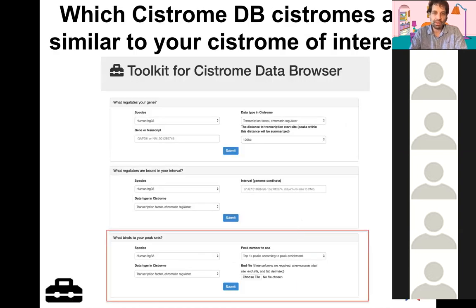And the final function of the toolkit is asking which Cistrome Data Browser Cistromes are similar to yours. In this case, you have to upload a file in BED file format. I'm sure you're probably familiar, just the chromosome, start site, end site, tab delimited file.